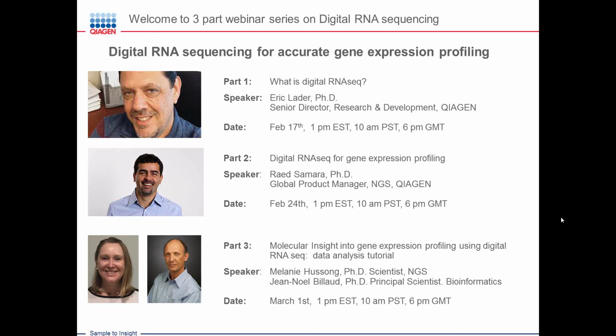Everything that we're doing here in this part of QIAGEN in Maryland is about targeted sequencing, and today, as Krishnan said, we're going to be talking about targeted RNA-seq.